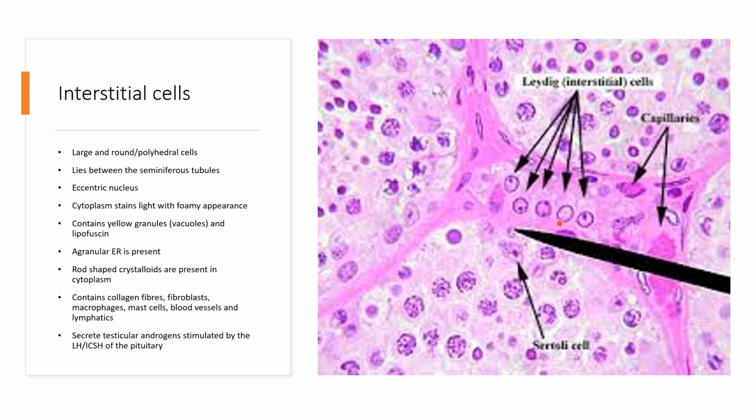Okay, we're going to stop here, and we look forward to discussing that of the female. We're going to look at hopefully the uterus and ovary, and also try to look at some of the reproductive cycles that are characteristic of the females, and look at the microscopic features that are relevant that we should focus our attention on.